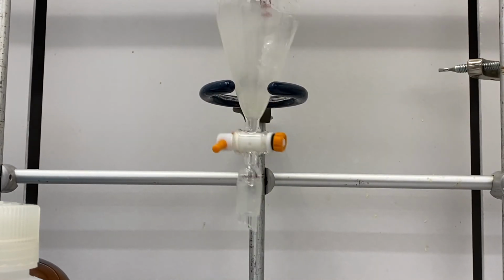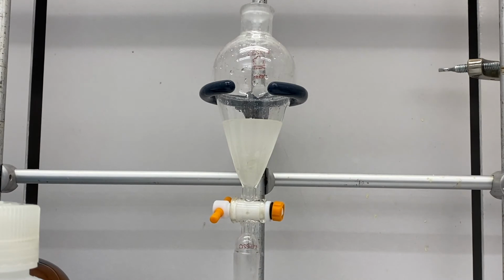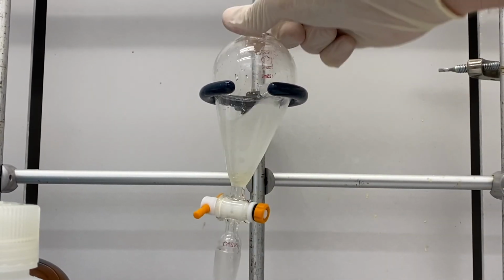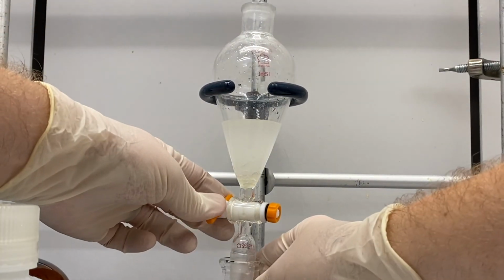Hopefully. You can see the droplets coming together, but they just aren't forming a good layer. They're kind of sticking to the side. I'm trying to get them to come together. Let's try again.